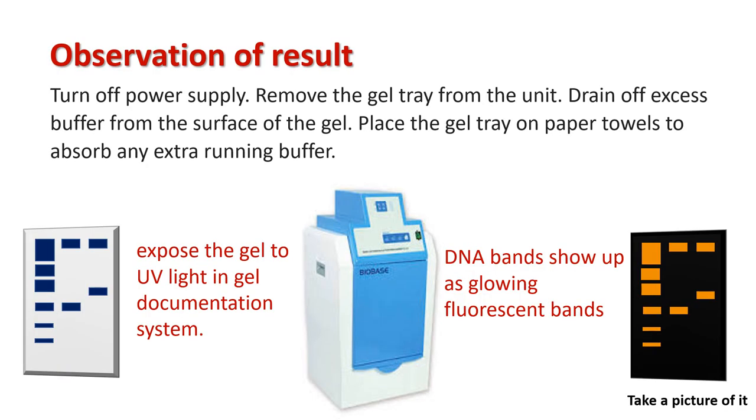To observe the result, turn off the power supply and remove the gel tray from the unit. Drain off excess buffer from the surface of the gel and place the gel tray on a paper towel to absorb any extra running buffer. Expose the gel to UV light in a gel documentation system — DNA bands will show up as glowing fluorescent bands. Take a picture of it.